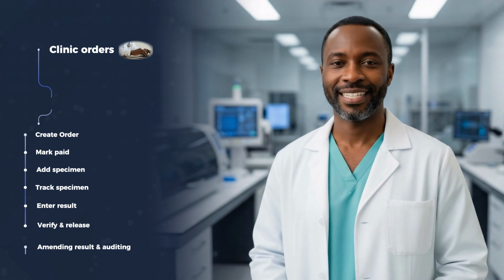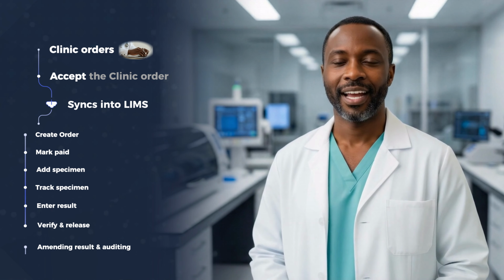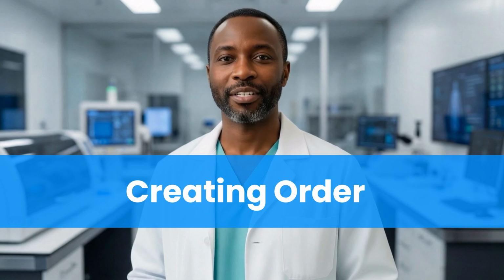Then we'll show the clinic order part. When a clinic orders a test on the clinic app, you accept it in clinic orders, it syncs into LIMS, you run the same workflow, and finally use auto-upload results PDF to send the report back to the clinic. All right, let's start from the orders page.